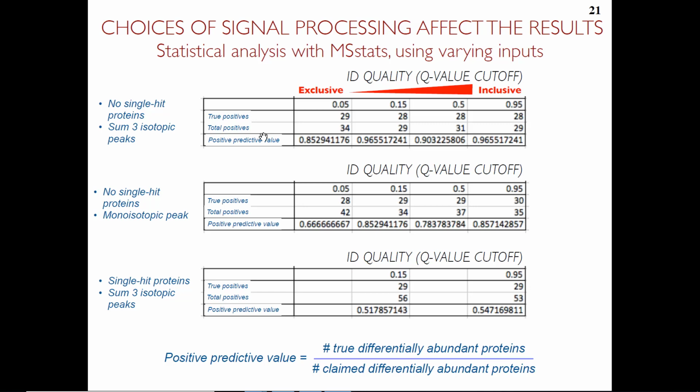So first of all, you would want to have multiple of those mixtures, but you also would want to work with biological studies. And in fact, in the last 2.5 days, we will not be working with that. We will be working with the actual biological data set with DIA, which will be processed in different ways. And for this data set, we have some sense of biology. So we will be using biological patterns to evaluate the performance of different processing, as opposed to just the spiking. So this will be a lot more meaningful than what we do here.